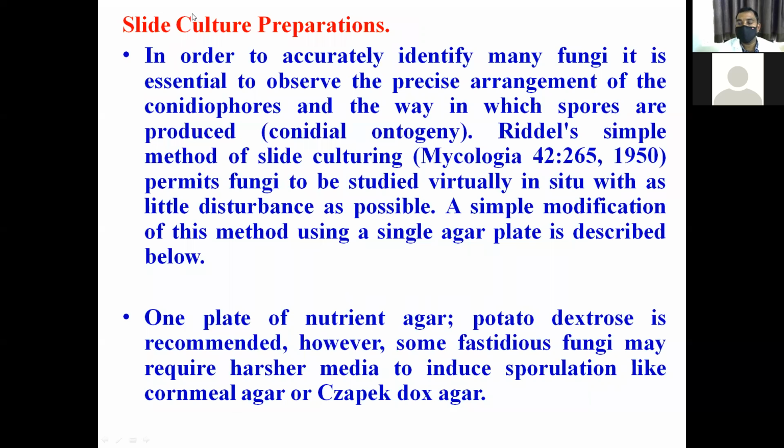Now we are seeing slide culture preparation. How to prepare slide culture preparation? In order to accurately identify many fungi, it is essential to observe the precise arrangement of conidiophores. Already I said conidiophore, conidia, sterigmata, vesicle, septate hyphae. You already saw them in Aspergillus.